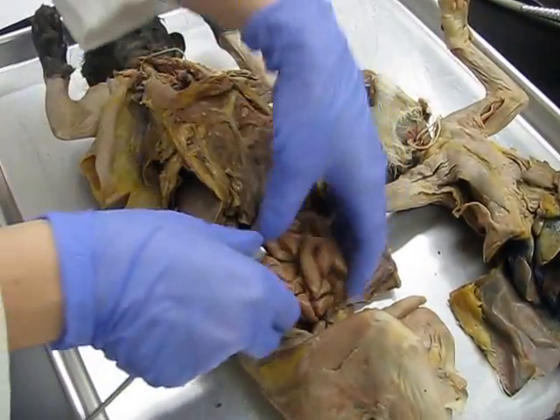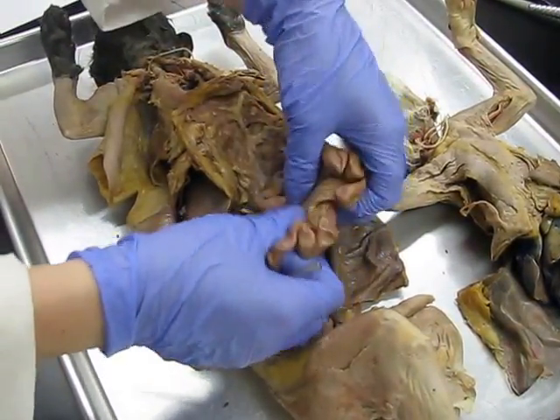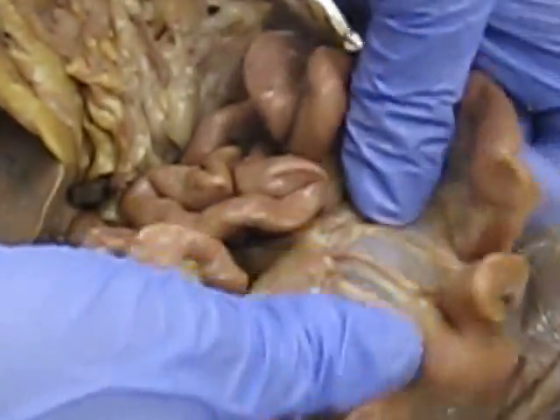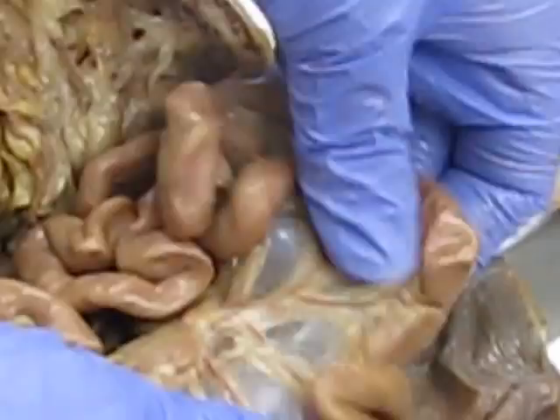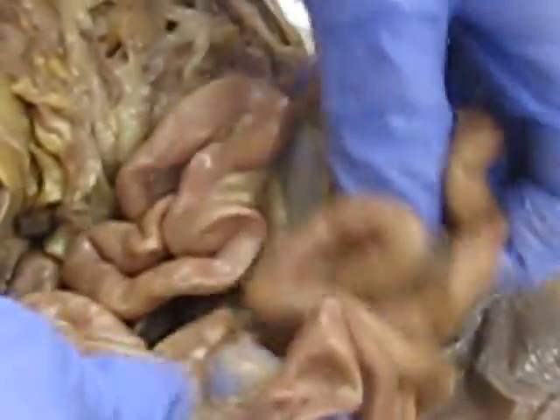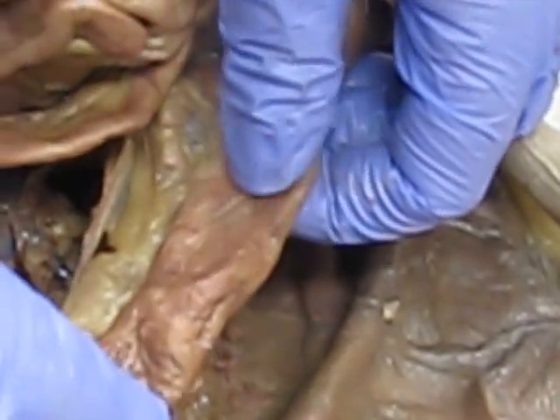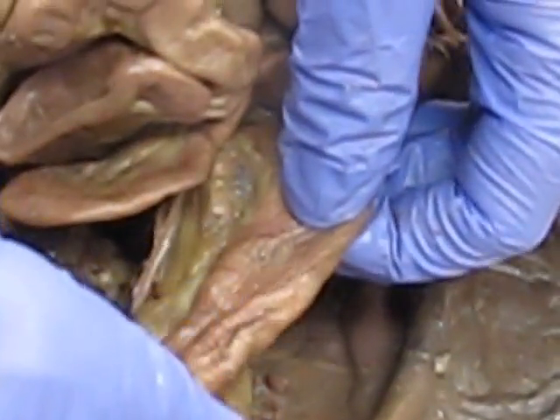If we pull that away, we can see the small intestines, and if we look between them, we can see the mesentery of the small intestines, prevents them from becoming entangled when they're moving food through. We can also see the large intestine here as well.